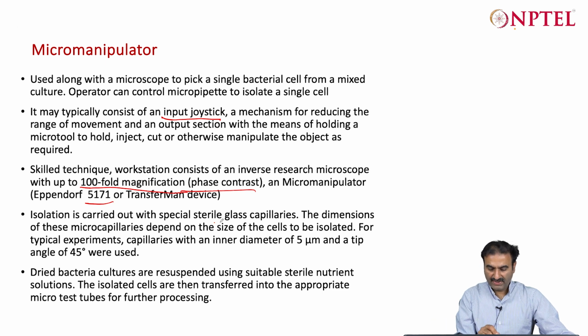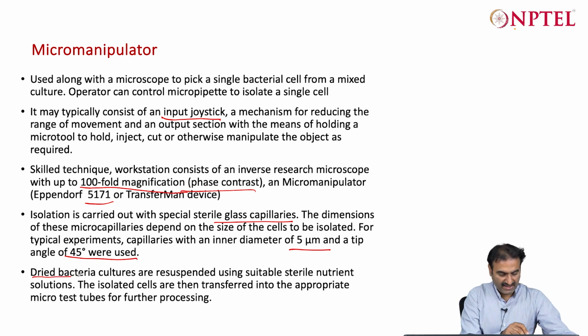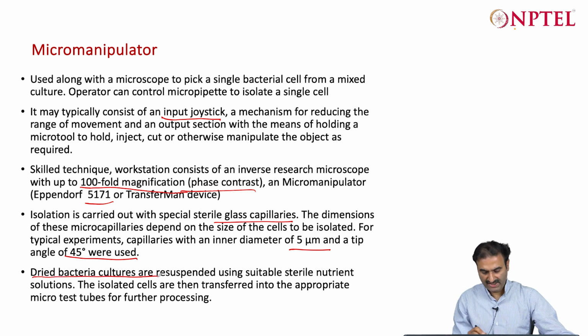So sterile glass capillaries of micro size are needed to capture the microbes, which are about 5 micrometer, and they should be at an angle of 45 degrees to actually pick the cells one by one. So cells could be dried bacterial cultures resuspended in a suitable sterile environment or nutrient, right, which are actually put on the slide for the pickup.